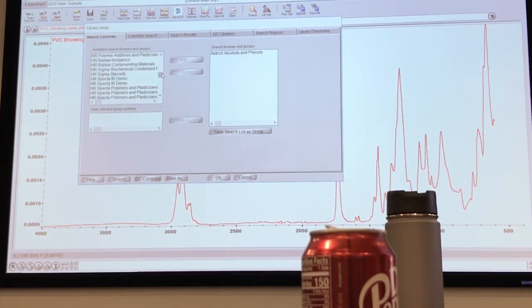Okay, so between like 1,000 and 2,000 is the little... 1,600. Oh, 1,600, okay. 1,600 and 1580, sorry. Mm-hmm. But depending on where it is getting added into, whether it is PET or whether it is the DEHP, the DOP, whatever it is, those two little things will stay pretty consistent. It will all have that little characteristic peak. Okay. Thank you.